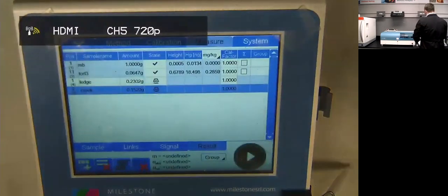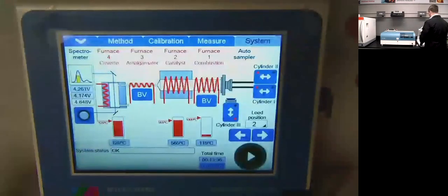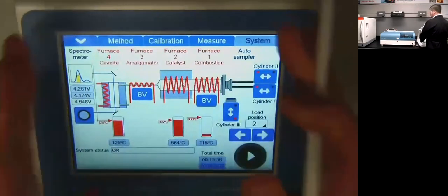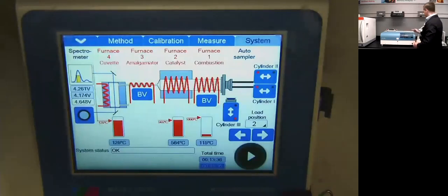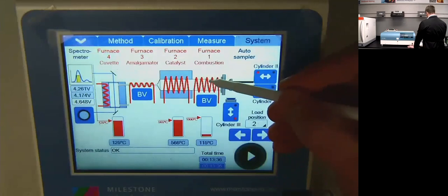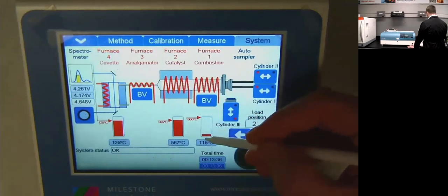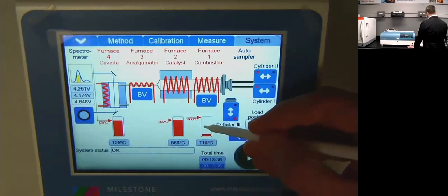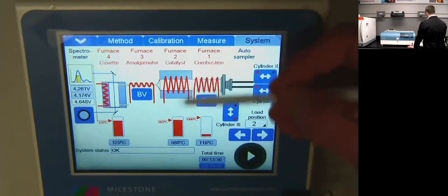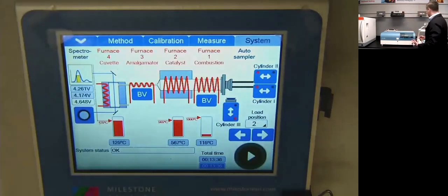This is our software terminal. When you open the system, it starts on the system tab. These are essentially columns that mirror exactly how the inside of the system looks. We have our auto sampler arm, our combustion furnace — which starts at roughly room temperature and during our method will heat up to 650°C to ash and volatize off all our mercury — and our catalyst furnace, always at 565°C, which converts all mercury into its elemental form.